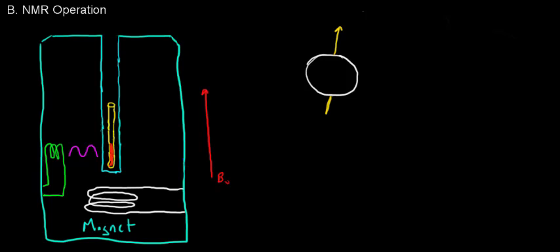The magnetic moment is actually rotating. The term for this is precessing in the applied magnetic field. And so if this is the axis, we can think of this as an axis, this magnetic moment is rotating. So it's really this, when this thing is oriented with or against the magnetic field, this magnetic moment is rotating, it's precessing. It's like a wobbling top on a tabletop. And this precession has a certain frequency.